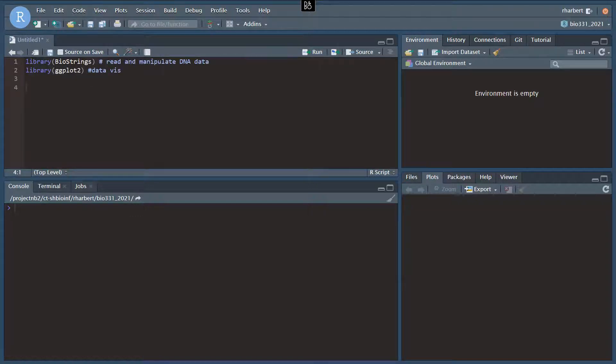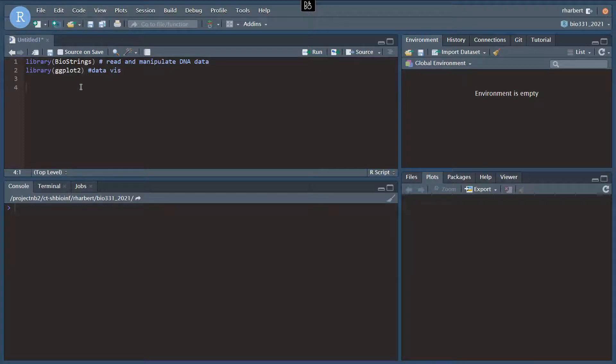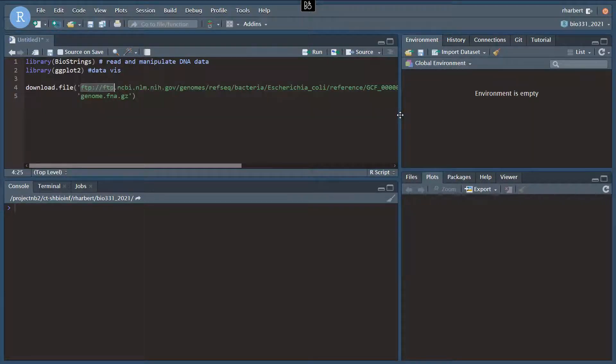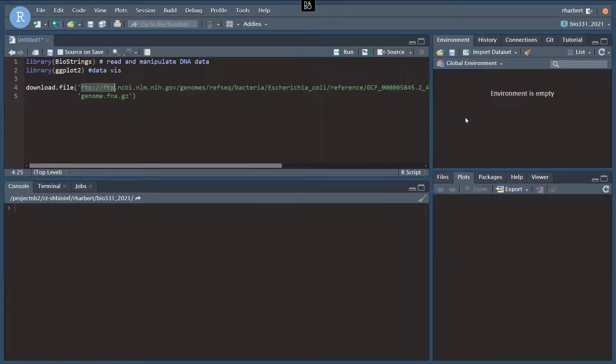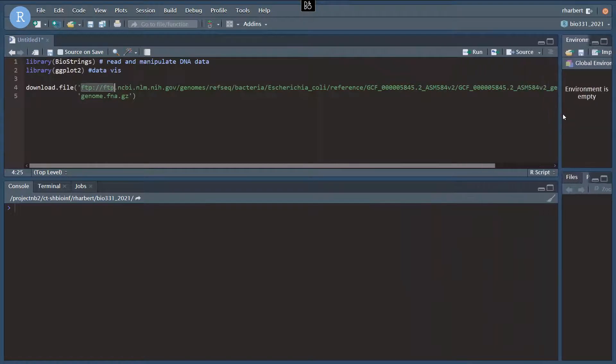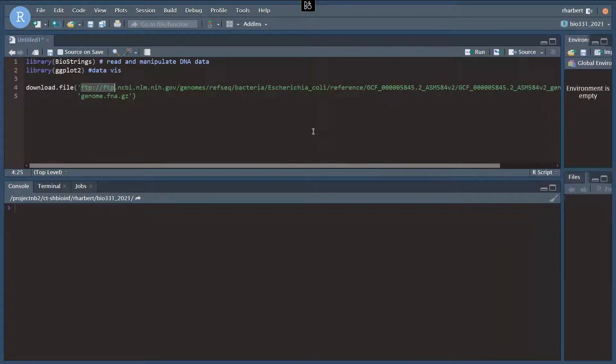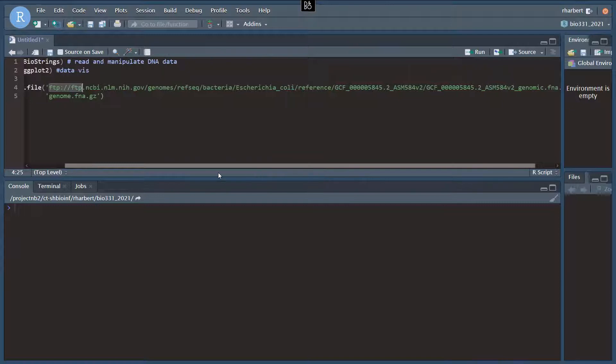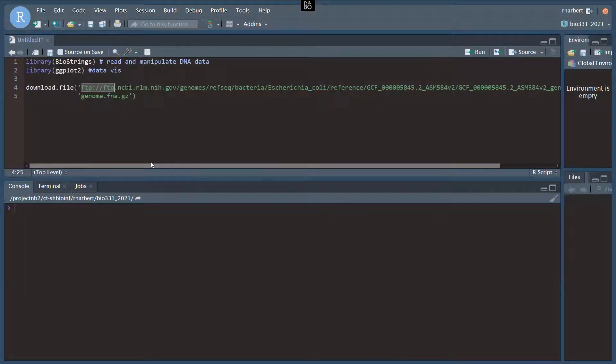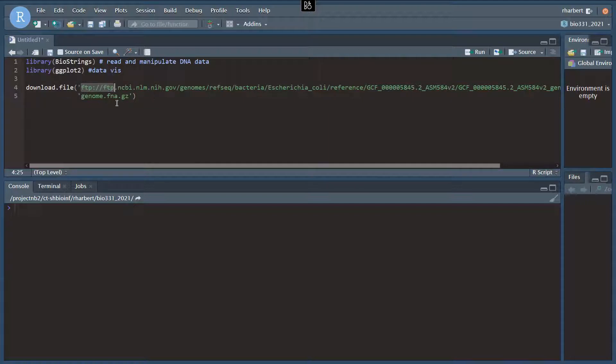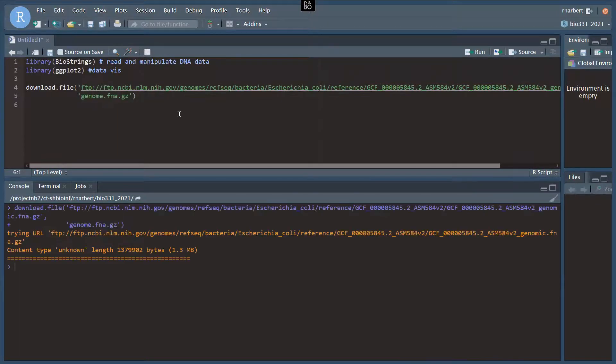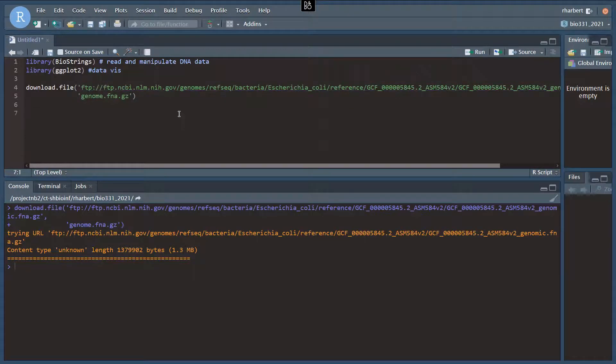Okay, to get our data, I'm going to paste in a command here. We're going to use download file and point that at the NCBI FTP server to grab a reference genome for E. coli. That's the whole path there. I'm going to include the code with this video, so you don't have to copy all that down right here. And we're going to save that as a file called genome.fna.gz. And it should download fairly quickly. It's about a megabyte, so on slower connections, it may take a few seconds, but not very long.